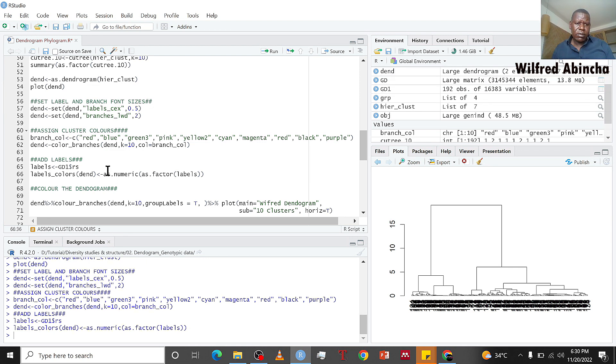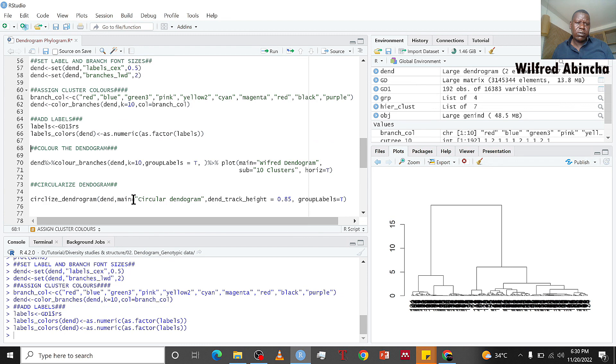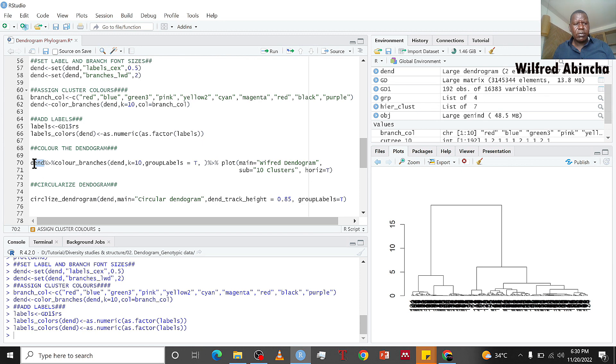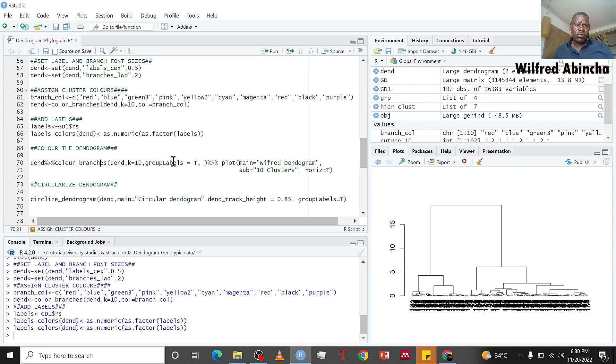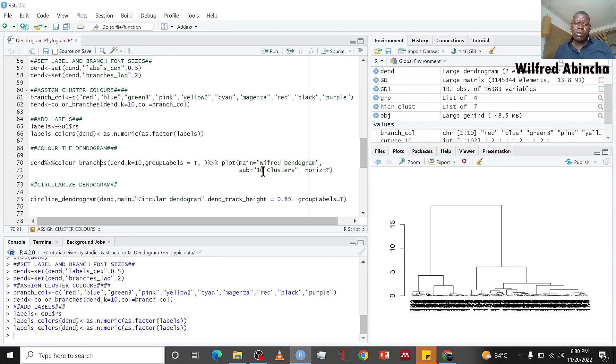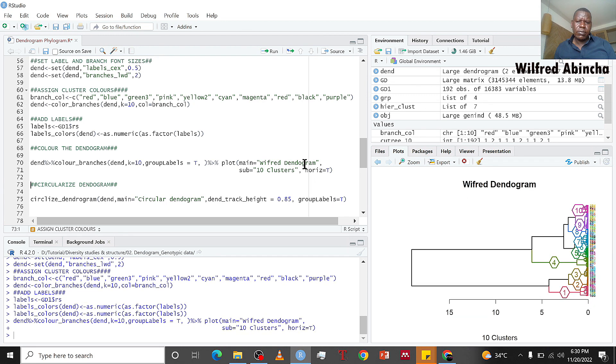Now we do the actual coloring and construction of our dendrogram. We use color_branches with K equals 10, put labels true, and plot it. We call it Wilfred dendrogram with 10 clusters. Horizontal is true so that it faces horizontally. Here we have our dendrogram with 10 clusters.